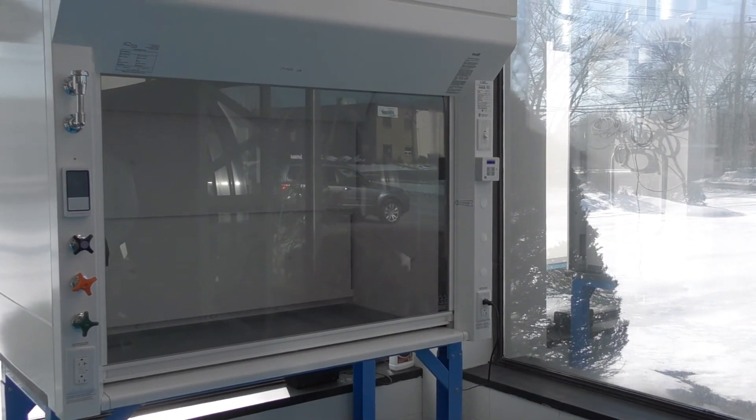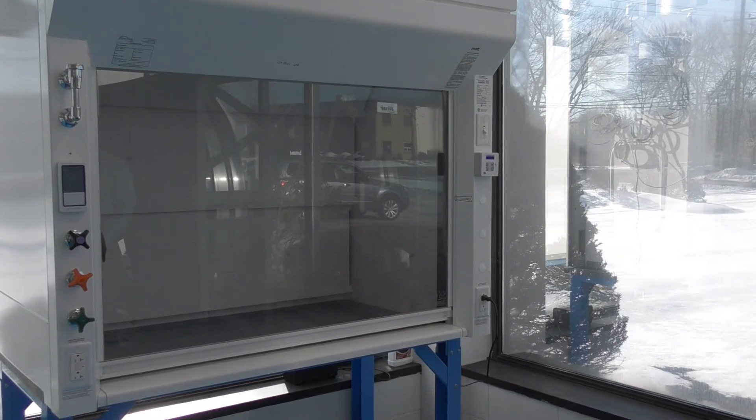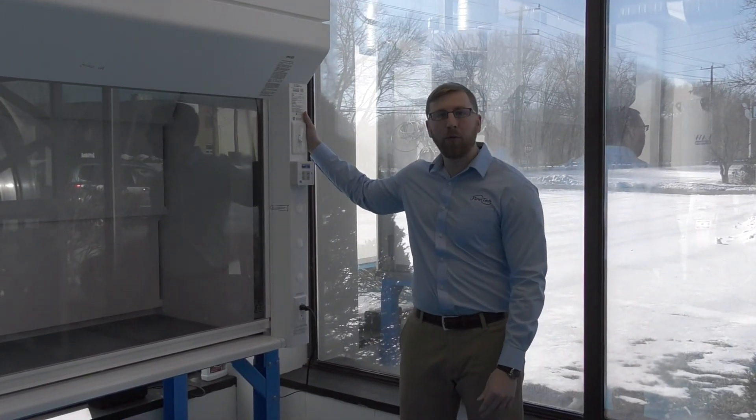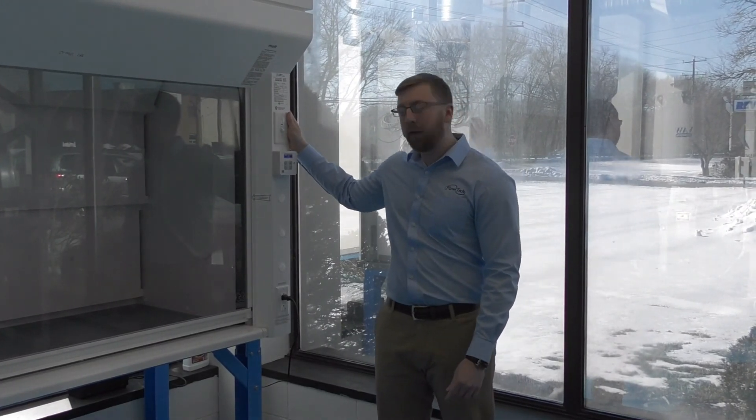The sash will stay closed as long as nobody goes and touches the fume hood sash and opens the sash. If you would like to learn more about the TEL auto closing sash system, or you have a potential fume hood to mount one of these systems to, please contact me. Flowtech will send out one of our technicians to do a field survey and determine the components needed for your fume hood. Please keep in mind that this is for single rising sashes only.